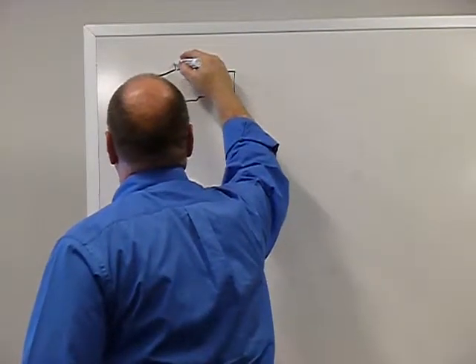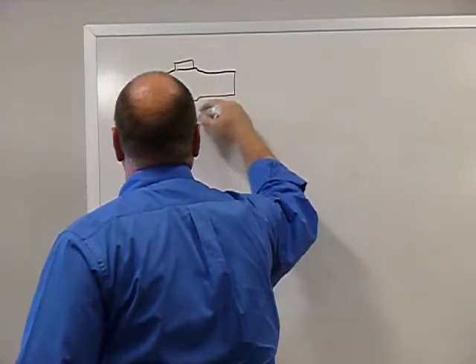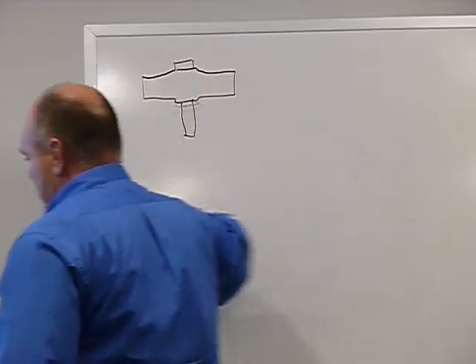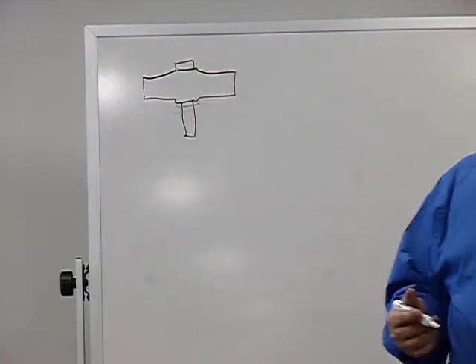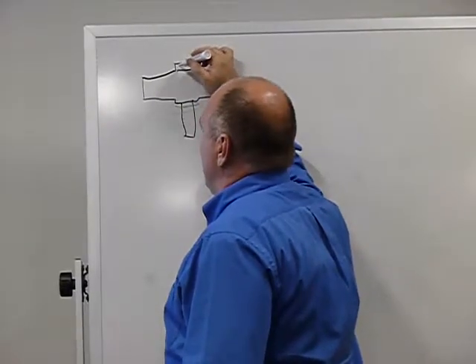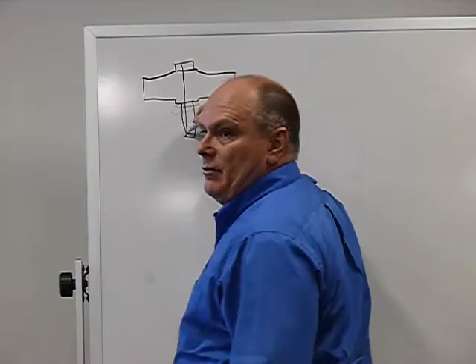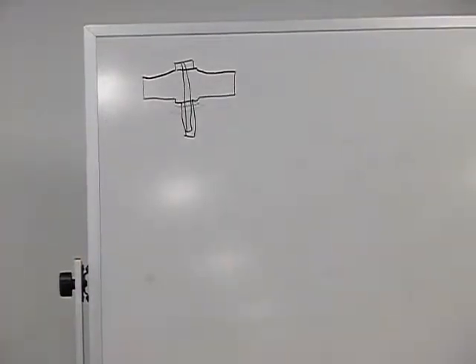And it's got a big plastic screw that goes through the middle of it. This is what goes down the hole, and I think there's two black rings right here. This is your regular hold down clip. This is how they are, most of them now, and that's all the ones we have for replacing now. But back in the old days, they had the same type of clip here, but the middle piece was made of a different plastic, and it had a piece of metal with threads on it, and it was plastic coated going through the middle here. They break all the time. They used to break all the time.